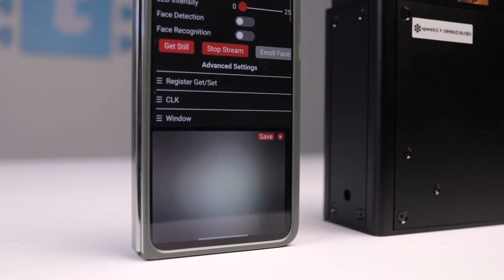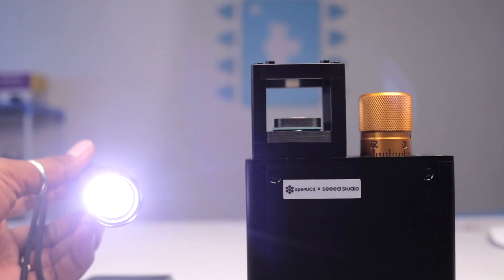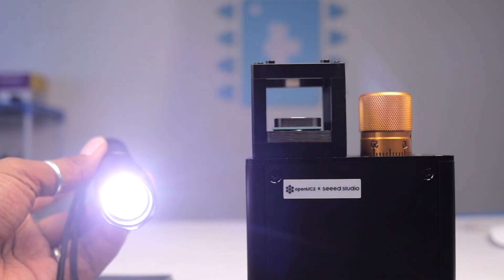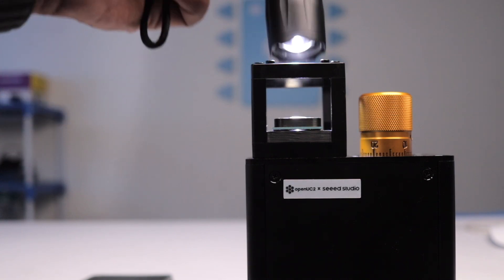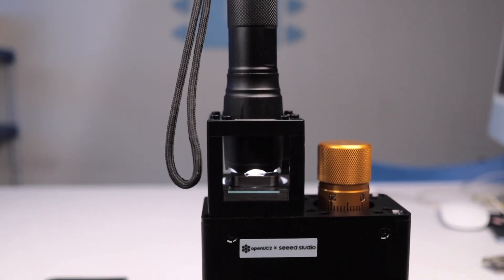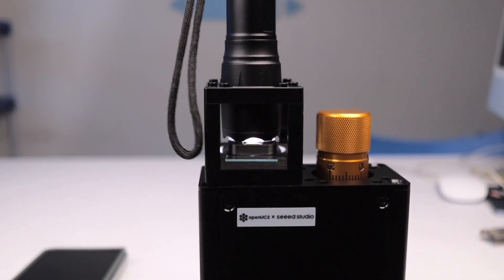Just click 'Start Stream' and you can visualize the live footage from the microscope. Super easy, right? You'll also need the flashlight placed on top of the sample to act as the main light source. It's so simple that even a 3-year-old can use it quite easily. Now let's try to visualize some microorganisms in it.